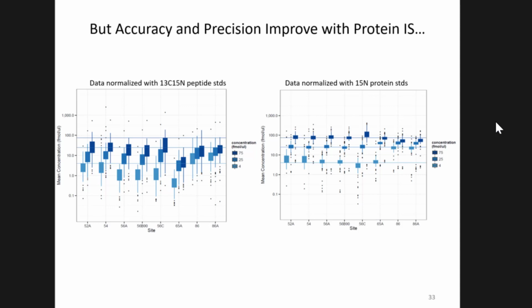But we were kind of on the upper limit of what we could monitor at that point because it was over 1,000 transitions for the 3 peptide form experiment, the N15, C13N15, and light. But definitely if it was something like you were doing DIA, then you could go back and probably pull that information out of the data.